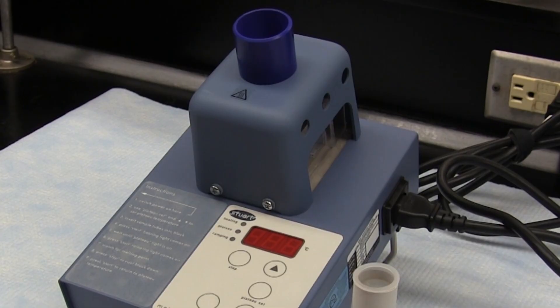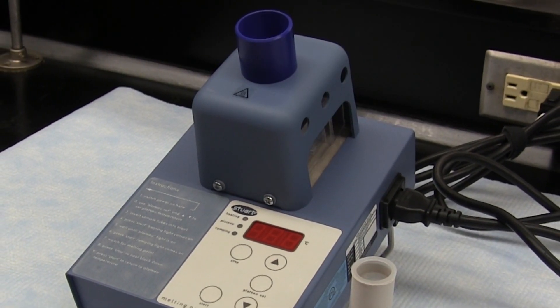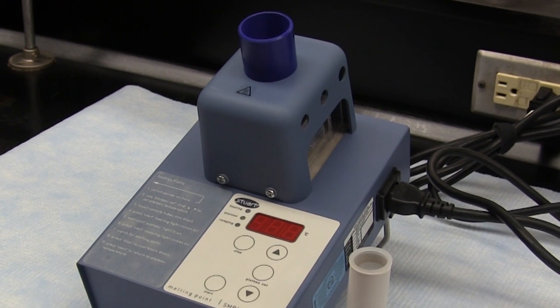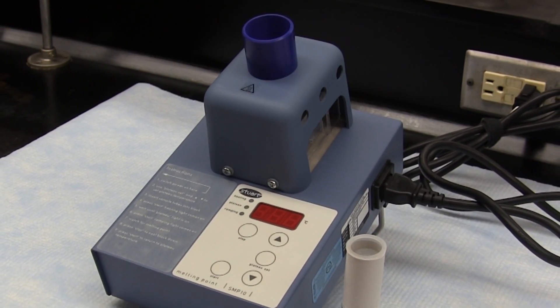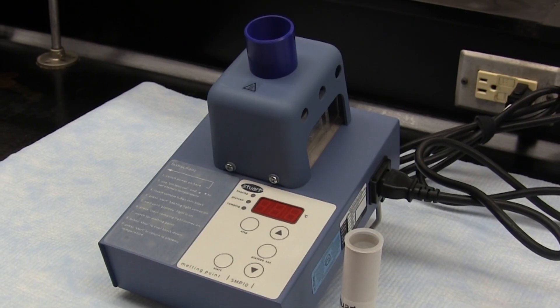Do note that our supply of Stuart Apparatus may not be large enough at this time to guarantee availability when you need to obtain a melting point, so you'll likely have to be familiar with all three apparatus.